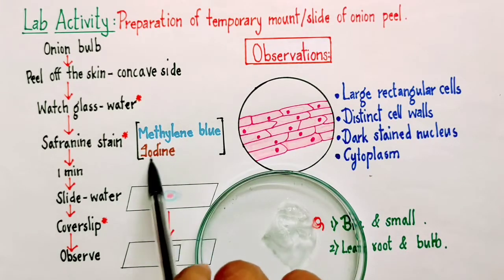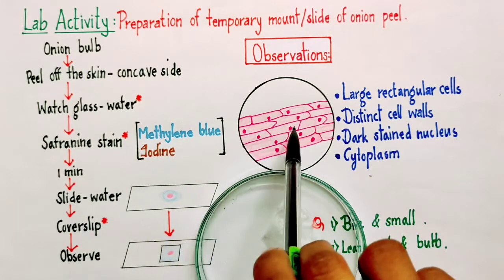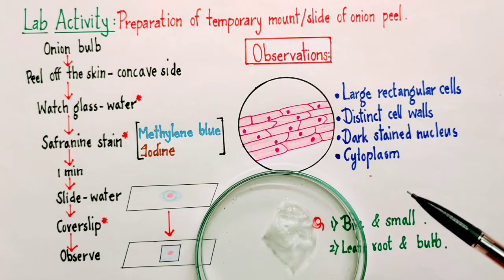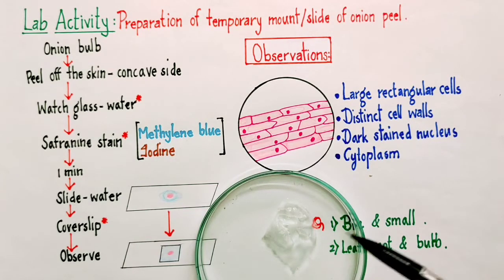If you use iodine, your cells are going to appear in the shades of brown. Some part will be darker brown, some part will be light brown in color.